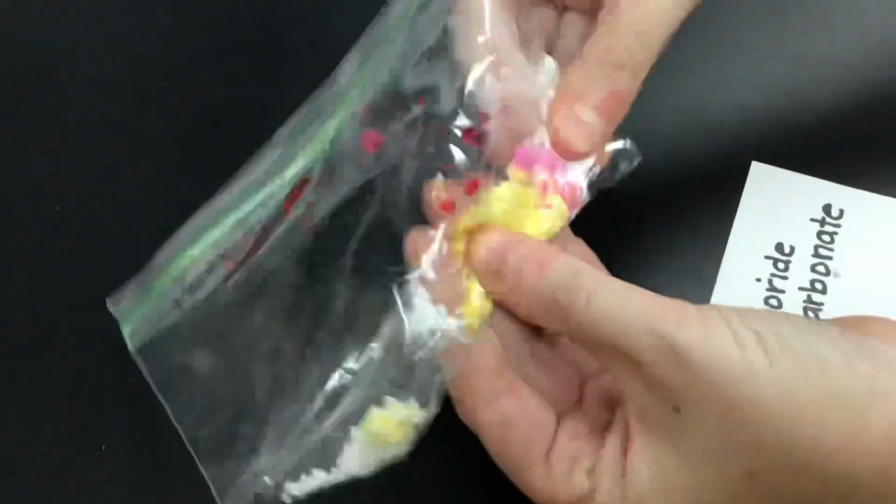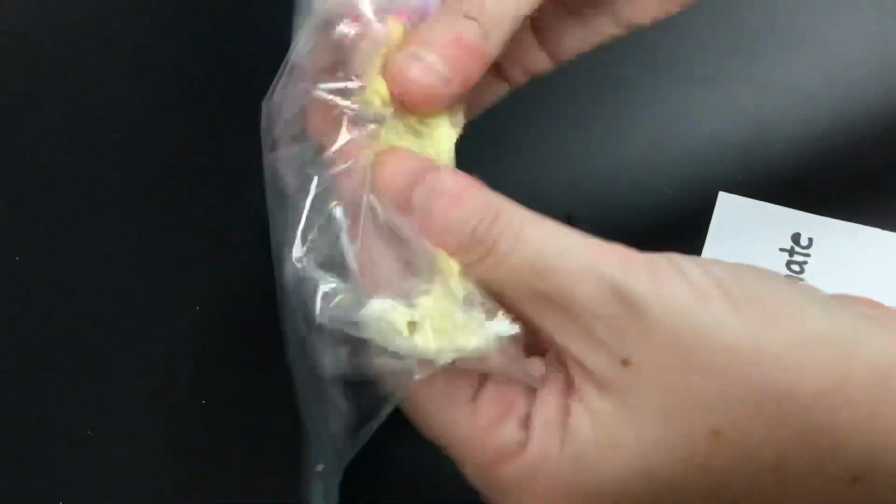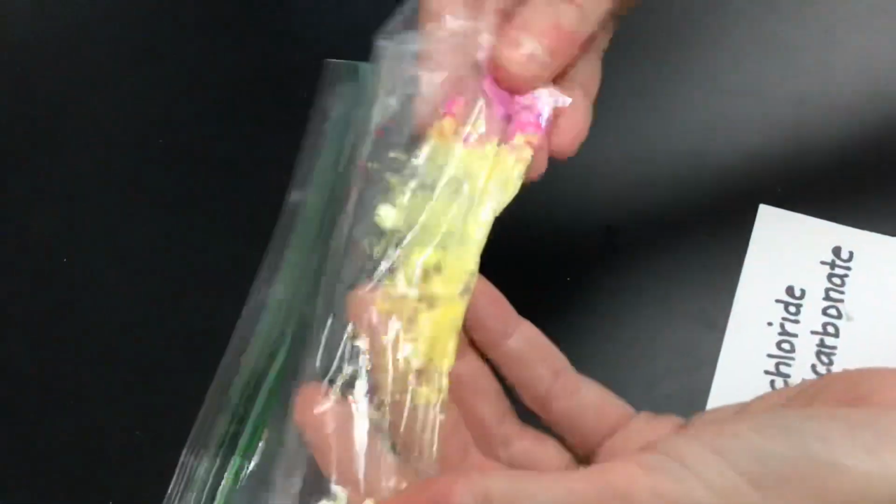All right, so you can see there is a color change happening. It's also releasing heat, so my fingers are getting quite warm. Got a couple different color changes happening. There's some bubbles, it looks like. Any of this stuff you are going to write down under part A on slide number 3, where it tells you to describe the overall reaction. What does this look like? What happened?